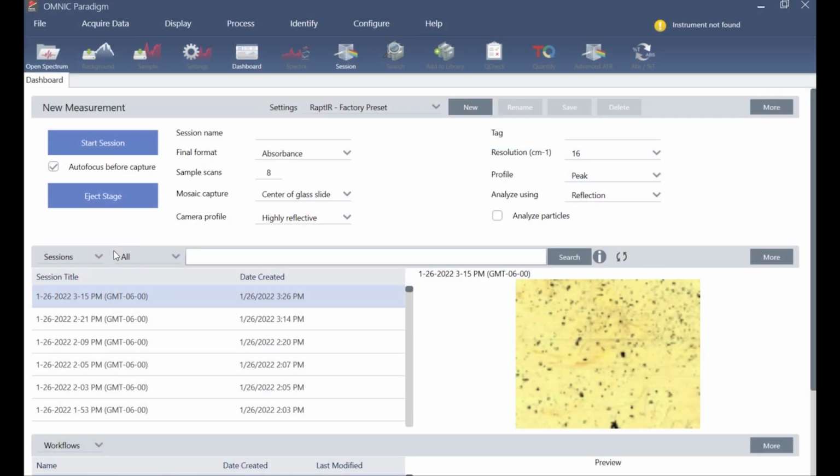It's easy to recall a map. Let's take a look at it now. First, you can recall single measurements, reports, or sessions from the database. You can look for them depending on the age of the data: today, a week, a month, or a year ago, or all of your data.